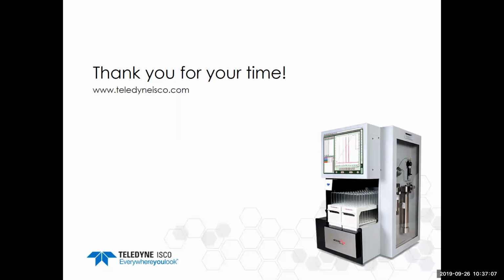Is the focus gradient generator on the Combi Flash RF? That's an older system, and the Combi Flash RF won't have this built into it. However, again, we can work off the spreadsheet and from an analytical HPLC, as I just discussed.